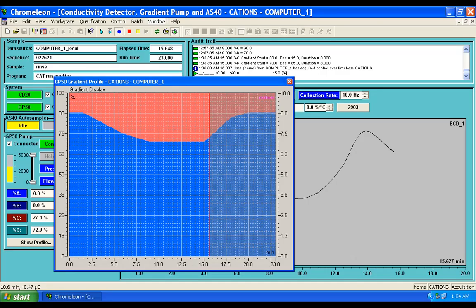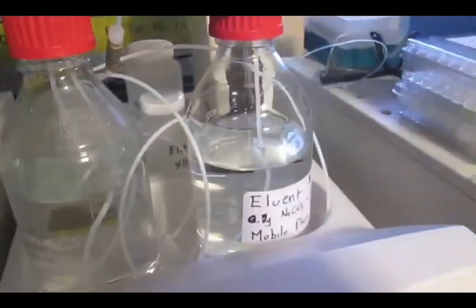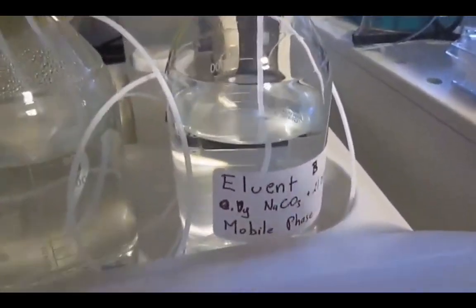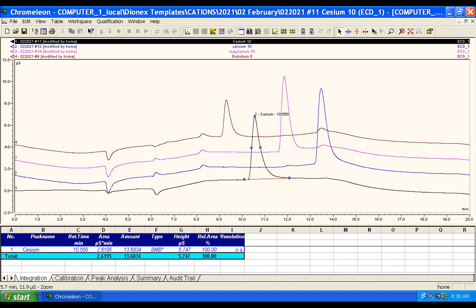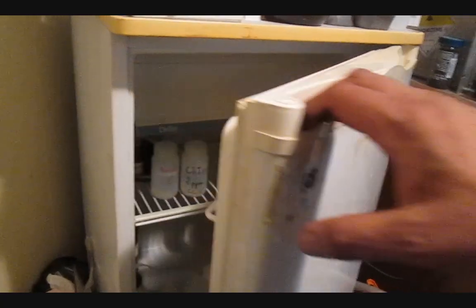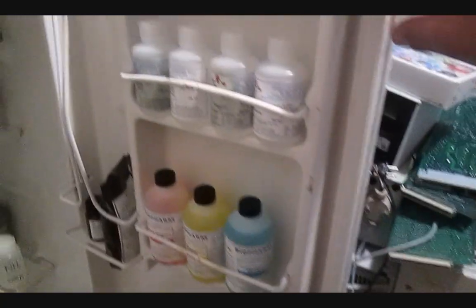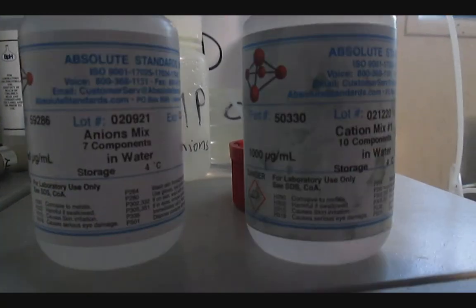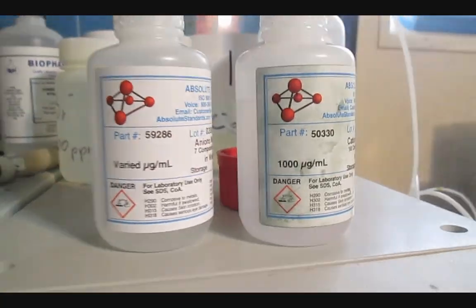On the cation side I'm also using a gradient method where the concentration of the eluent changes during the analysis. The advantage of this is the ability to separate nearby peaks. If you remember, I had trouble separating rubidium and magnesium, and calcium and cesium. This is now easily done while cutting back on the analysis time, keeping it roughly at about 20 minutes. Finally, I purchased standards to verify the calibration and certify the accuracy of the values I'm reporting — in the analytical chemistry world this is called a second source. You may be familiar with LCS and CCVs.